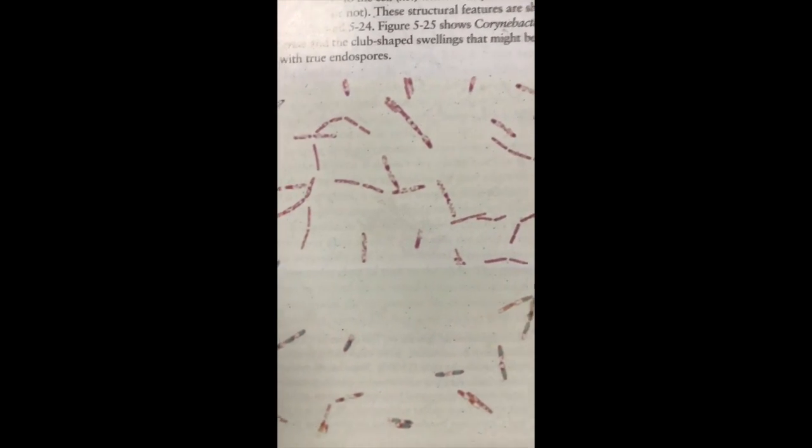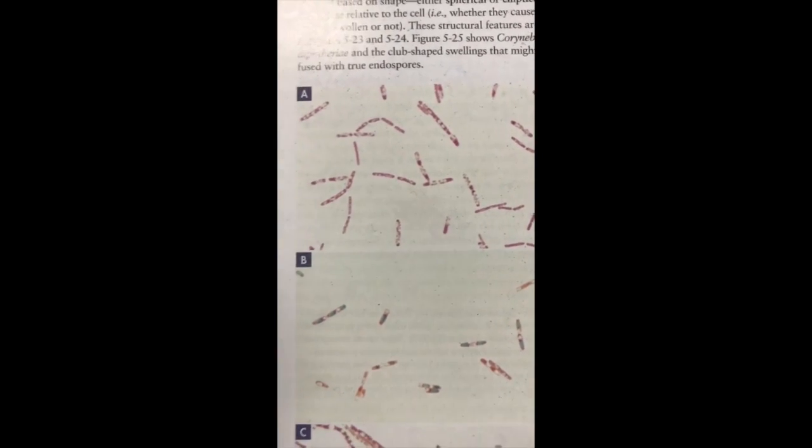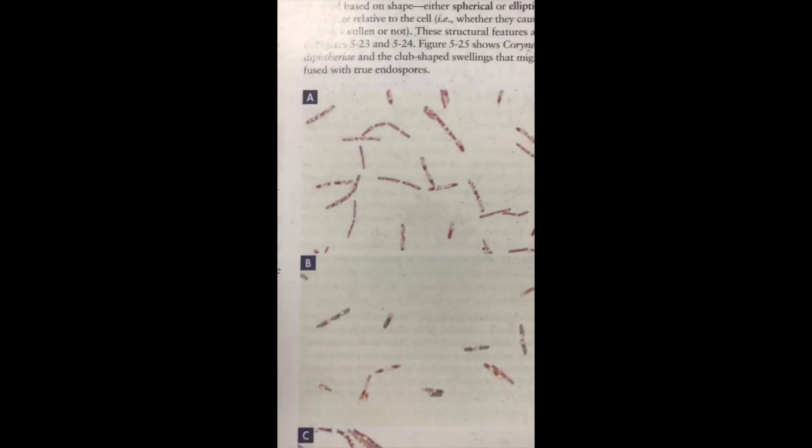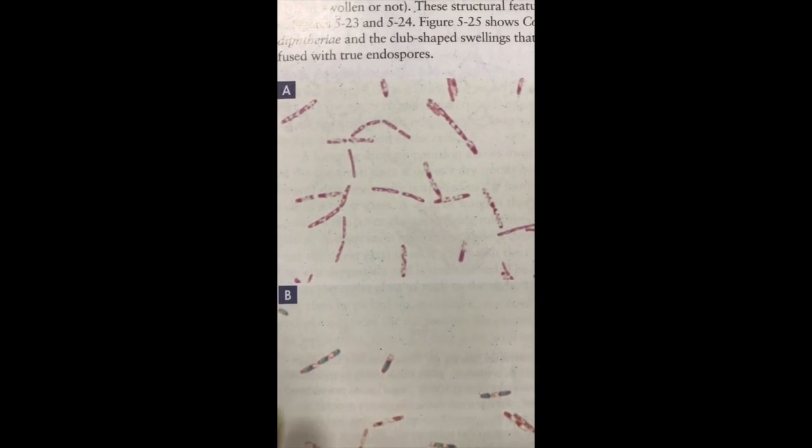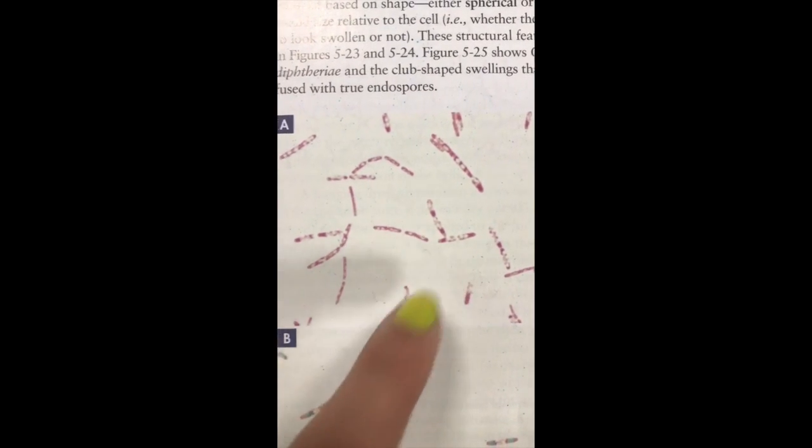4A here. Notice that this is an example of vegetative cells. There are no spores there, even though you can mistakenly think these tiny little green dots here are.